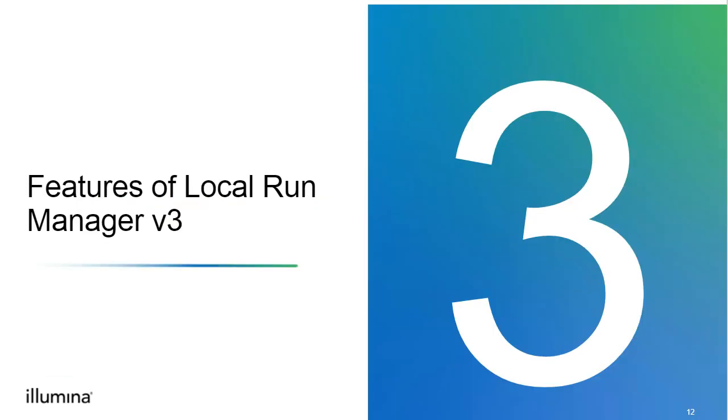Let's talk about these features specific to Local Run Manager version 3 and why we have a version 3 instead of iterating version 2 for the MiSeq.